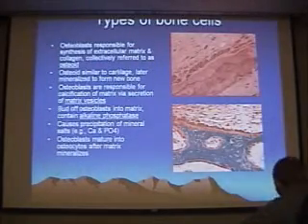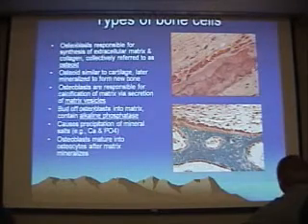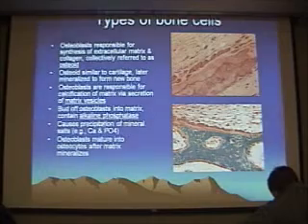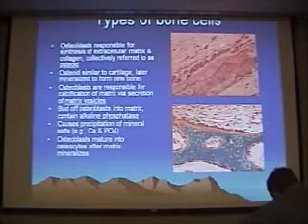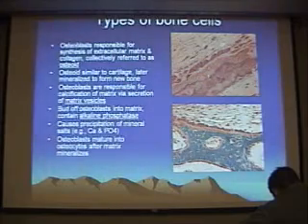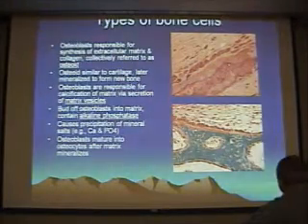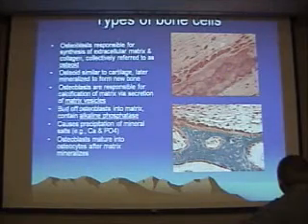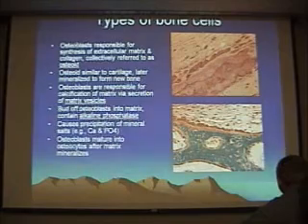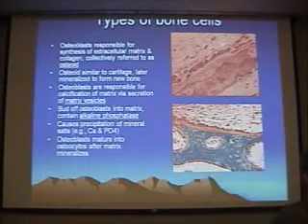Here we have some very nice views of these osteoblasts. Remember, large, darkly staining cells. And they initially produce an extracellular matrix which is unmineralized and very much like cartilage. That unmineralized matrix is called osteoid. And as it mineralizes, it undergoes a slight color change to become mineralized bone. And that process occurs as a result of alkaline phosphatase, which causes these minerals to precipitate out into the matrix.